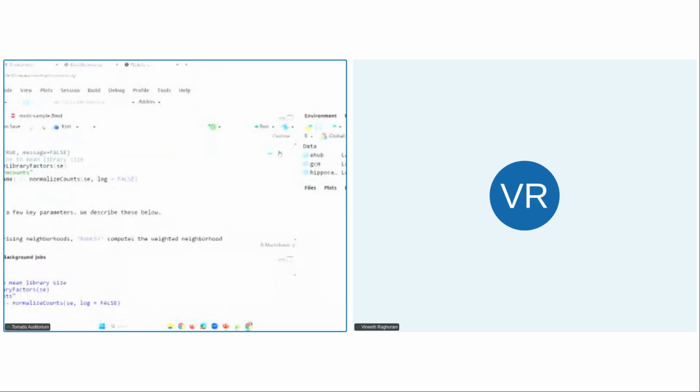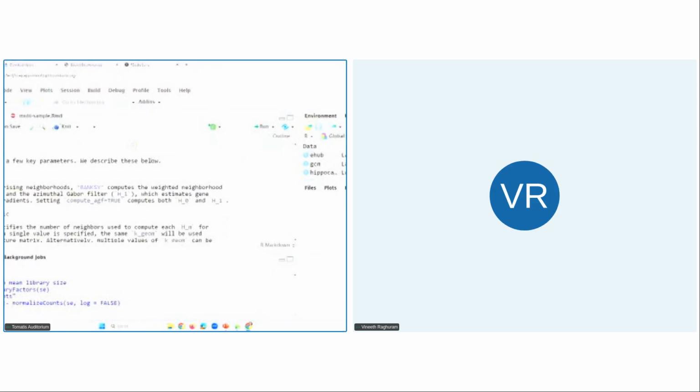Okay, normalization is done. And this is where the main stuff is. The first thing is AGF usage. As Vipul said just now, you have the own expression matrix, you also have the neighborhood mean average expression, and then the third chunk of the matrix is the gene expression gradient in the neighborhood. We've noticed in practice that whether you include the AGF or not, it gives a slight performance boost, but it also increases memory usage. So here you can determine whether you want to use that feature.